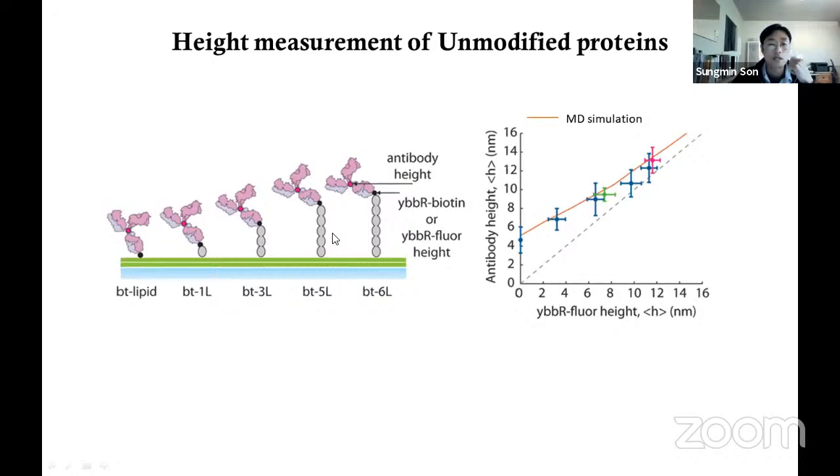So in this case, this antibody is labeled at its exposed lysine locations, and because it's labeled randomly, I would anticipate that the average height location of this antibody will be its center of mass. So now I've already measured the tip average height of these synthetic proteins. Now I compare the antibody location bound to its tip with its measured tip height.